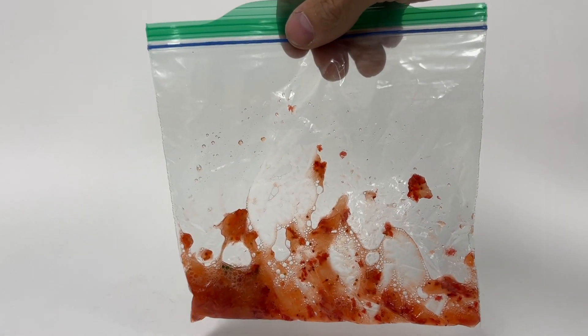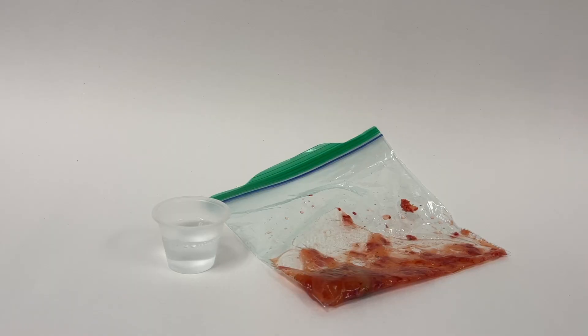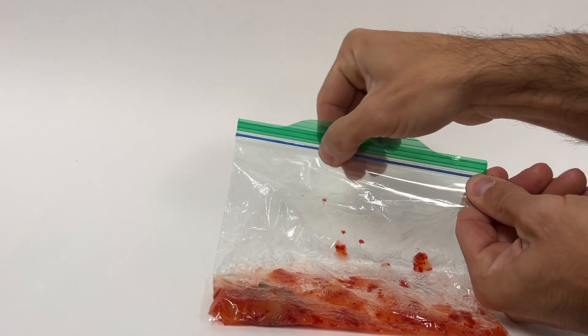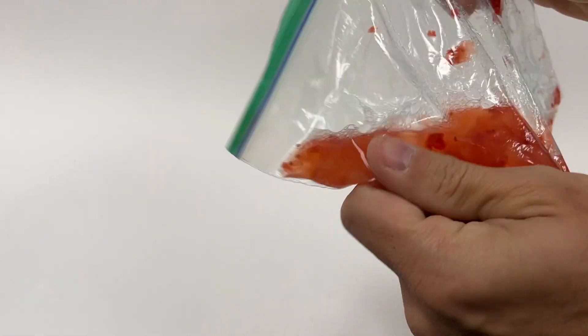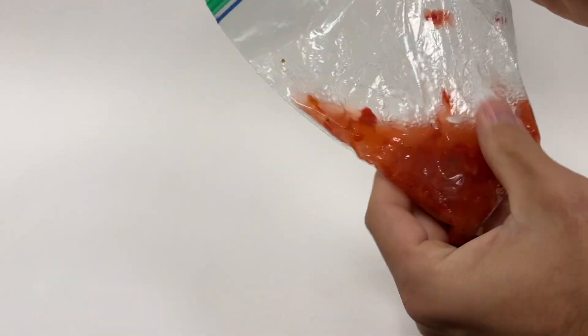Once the strawberry is thoroughly mashed, get the 20ml of soapy, salty solution and add it to the bag. Then take another 30 seconds to mix it up and mash it up a little bit more.